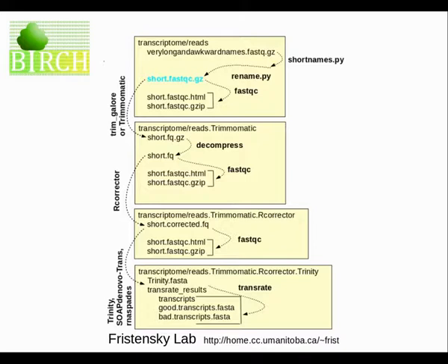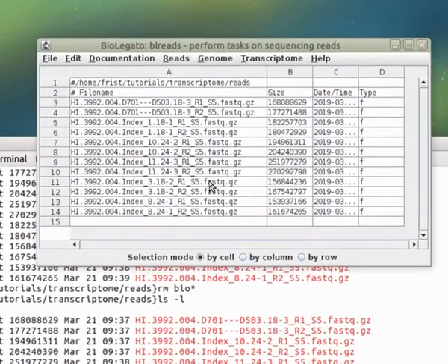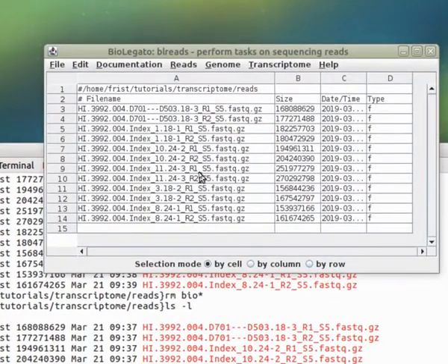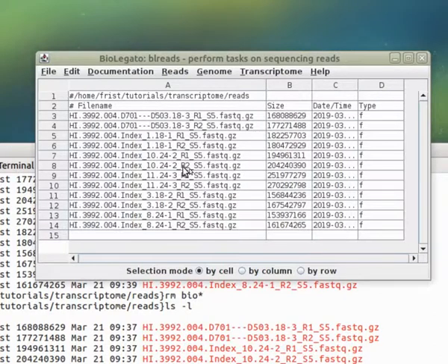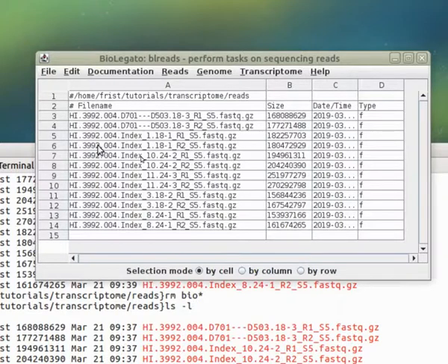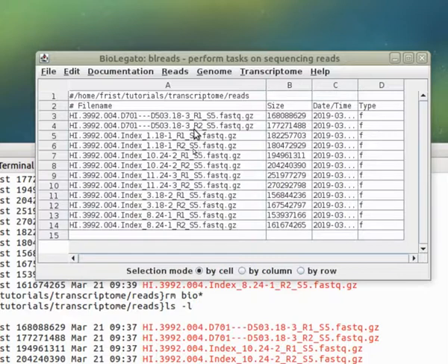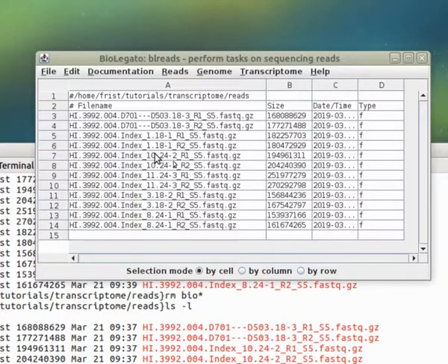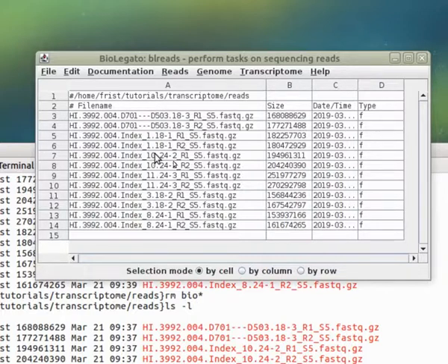Here's the BL Reads application, and it's designed pretty much like a file manager or, if you're a Mac user, the Finder. So it shows you the files in the current directory. In each case, these are Illumina sequencing reads in paired-end format. There are two time points, 18 hours and 24 hours, and then three replicates. For each time point and replicate, there's an R1 and R2 file that refers to the forward and reverse reads. This is really complicated in the way the file names are set up. One of the things I've found is that by making simpler file names, it drastically simplifies all of the downstream processes. We're going to create symbolic links to these files so that we can work with the links as if they were the files. Each link will point to a file.